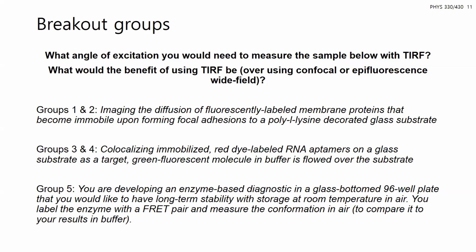So, we were thinking for the confocal, since this is a diffusion process, that the slower image capture would be less effective. It would depend on how fast it's diffusing, and diffusion in a cell membrane is slower, so it might be difficult to image multiple processes. So I would say confocal would be a little more challenging to get enough statistics compared to a wide field image where you can collect a lot of information at once.